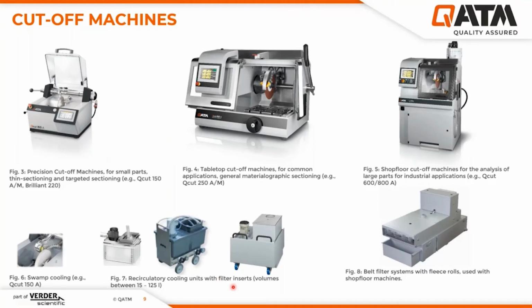And of course, they should be chosen depending on the size of the cutoff machine. Here we are talking about a precision cutoff machine, and with this we are most likely talking about a large tabletop cutoff machine or even a shop floor machine. If you have really high throughput applications with large machines and large cutoff wheels, you also can use a belt filter system, which is more effective than recirculatory cooling units.